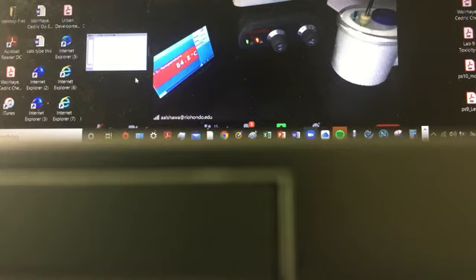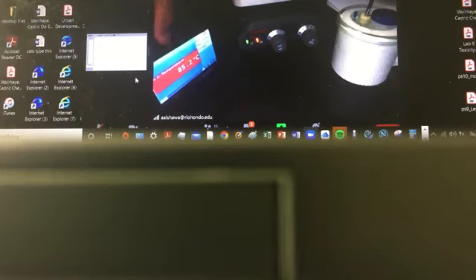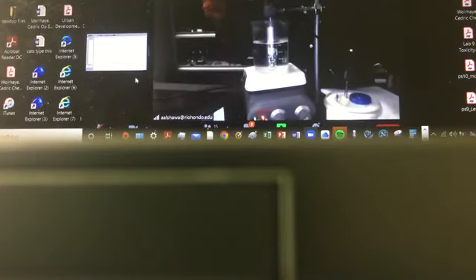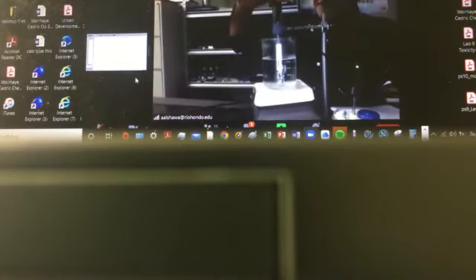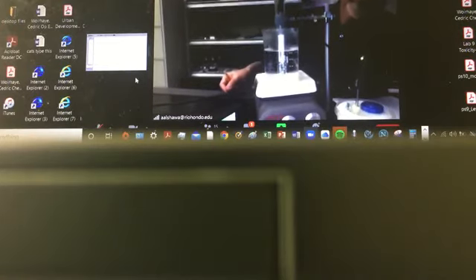Where is the temperature? So this screen right here is measuring that 85.3 so far, the temperature of the metal. So I'm measuring the temperature of the metal, and here's the thermometer measuring that temperature. And here's the value.